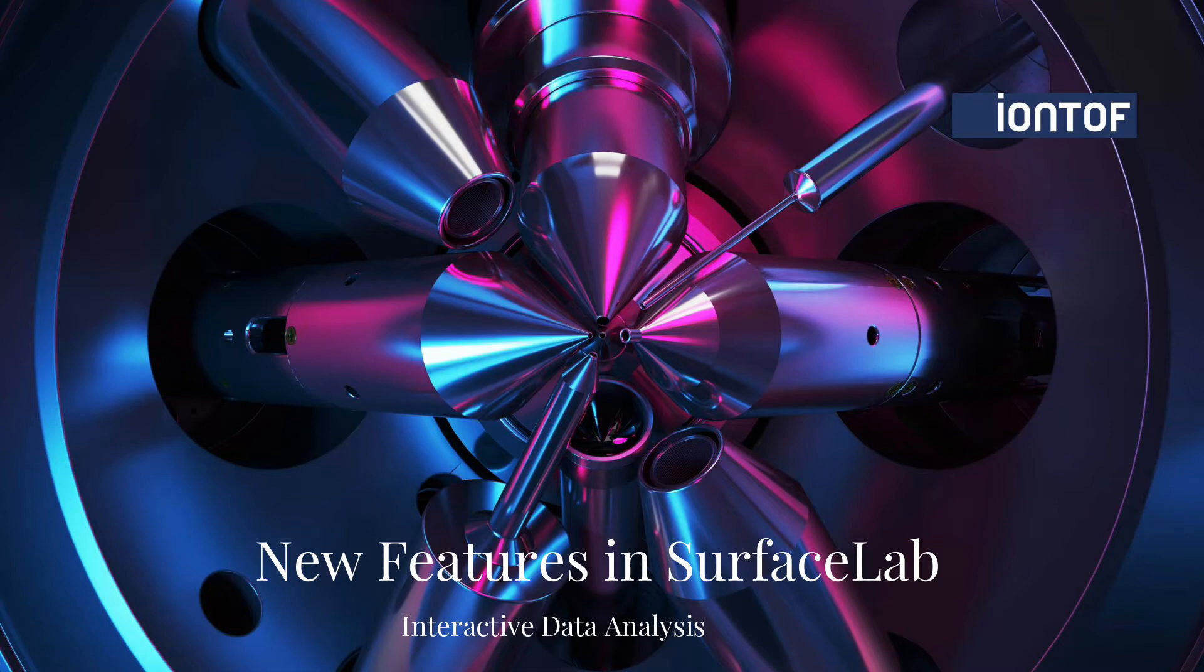Hello and welcome to another SurfaceLab tutorial. My name is Julia and today I would like to show you the Interactive Data Analysis, a feature which was launched with SurfaceLab 7.0 and is a giant step forward in the way we work with TOF-SIMS data.